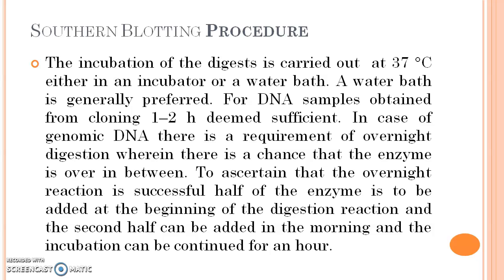is over in between. To ascertain that the overnight reaction is successful, half of the enzyme is to be added at the beginning of the digestion reaction, and the second half can be added in the morning, and the incubation can be continued for an hour.